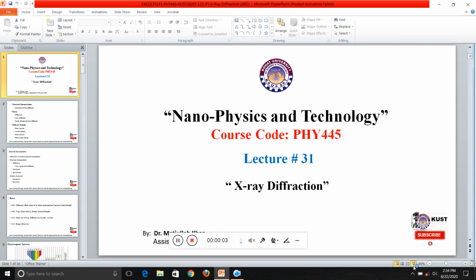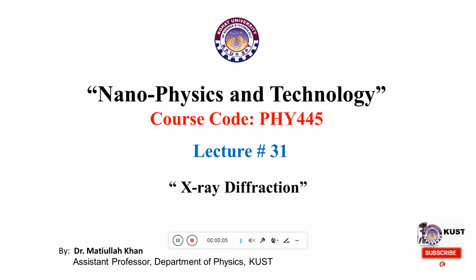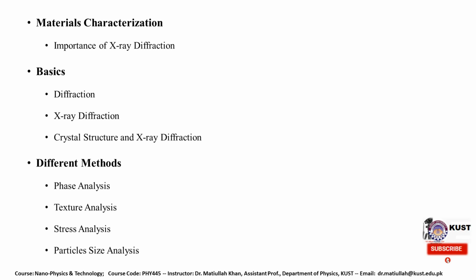Bismillahir rahmanir rahim. Today we'll be talking about the X-ray diffraction technique. This is one of the tools that is used for investigating the crystalline nature of the materials. Basically, in today's lecture we will discuss the importance of X-ray diffraction that is used for material characterization.